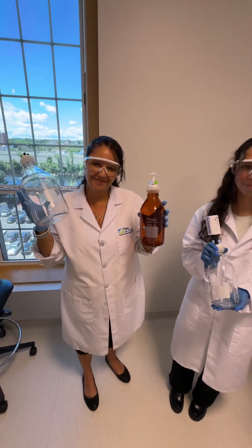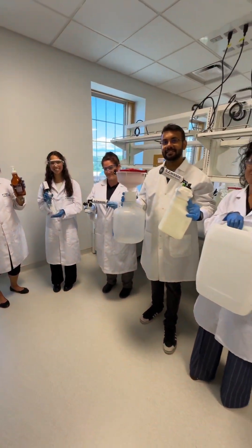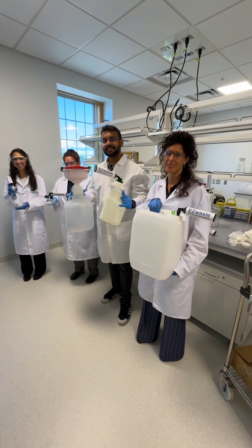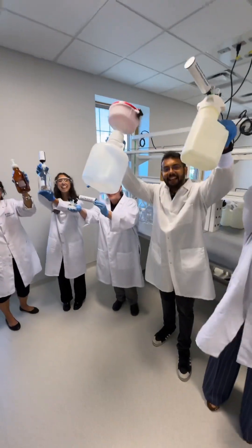So if you don't want VOCs in your lab and you want to breathe healthy air, definitely check out shopfls.com. Thanks so much for watching — Fox Life Sciences!